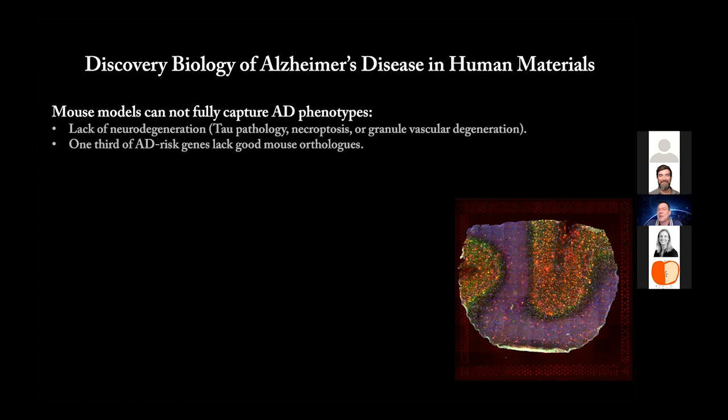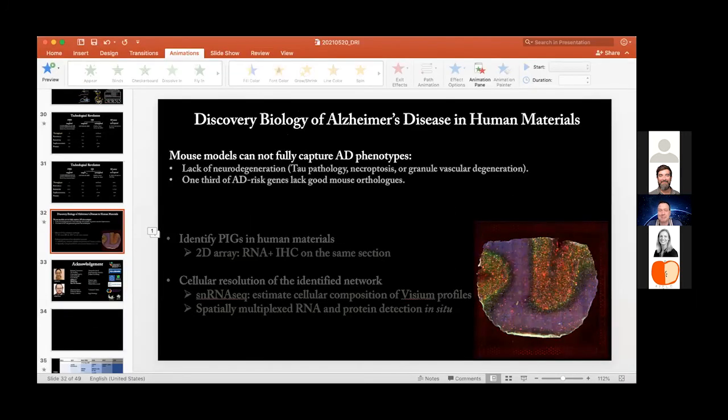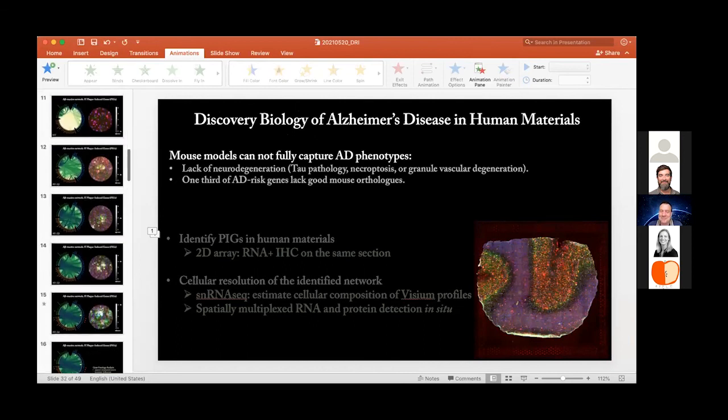Thank you. So we have another question from Bassem Hassan, who again writes, "Hello, impressive work. If I understood correctly, the hypothesis is that the interesting changes in gene expression in different cell types occur during the cellular phase of the disease, which precedes the phenotypic phase. If so, would it not be more interesting to focus on the changes that occur well before 18 months? So looking at these models at a younger time point. It seems to me that by focusing on the cell gene network at 18 months, you end up discovering the network that responds to the pathology, not the one that creates or propagates it." Do you have any thoughts about that? Have you looked earlier?